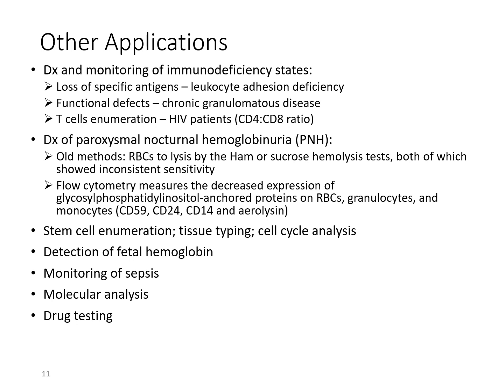For example, it can be used to diagnose and monitor immunodeficiency states like leukocyte adhesion deficiencies, chronic granulomatous disease, and also just to monitor the T cells within HIV patients to get that CD4 to CD8 ratio, which helps the clinician recognize the disease state and treatment, and the possible outcomes for that particular patient.